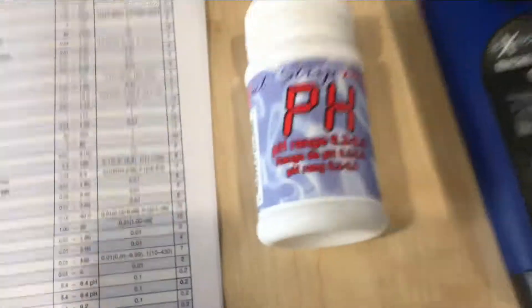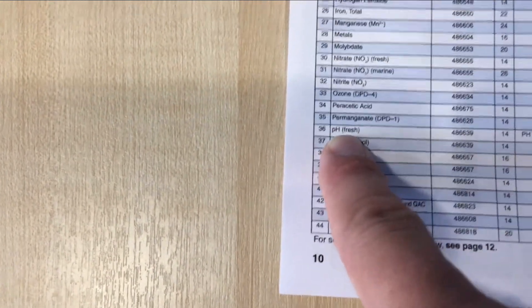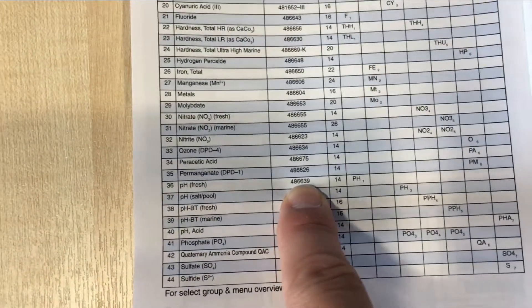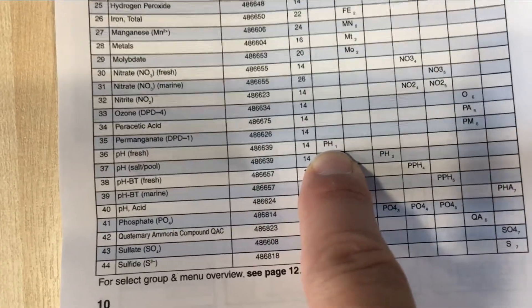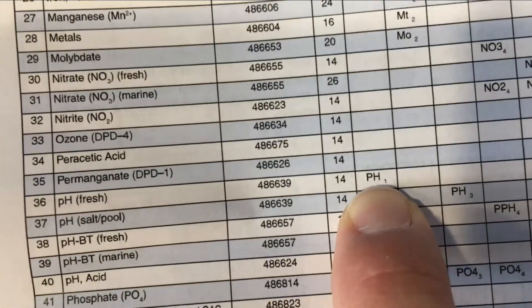In order to do the pH test, we're going to need the pH reagent and the appropriate menu. We open pages 10 and 11 on the manual and look for pH. We find the pH fresh here. We're going to need this reagent bottle. On page 14 we have the instructions, and pH 1 is the menu.